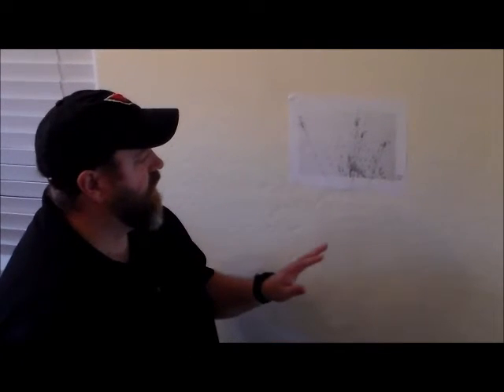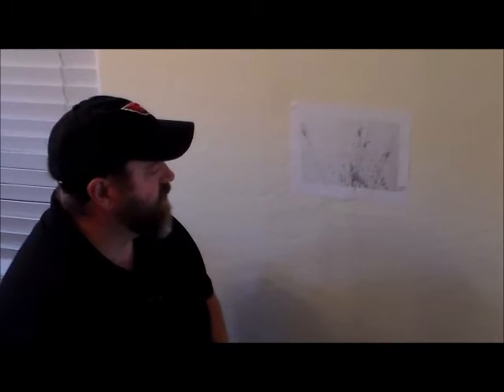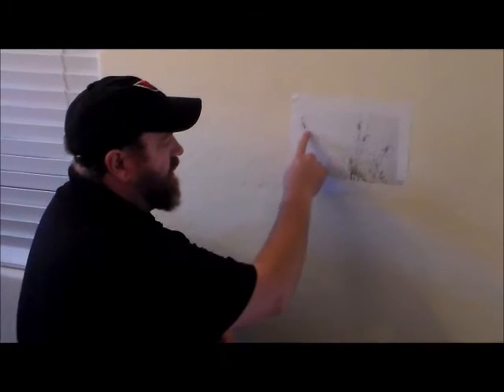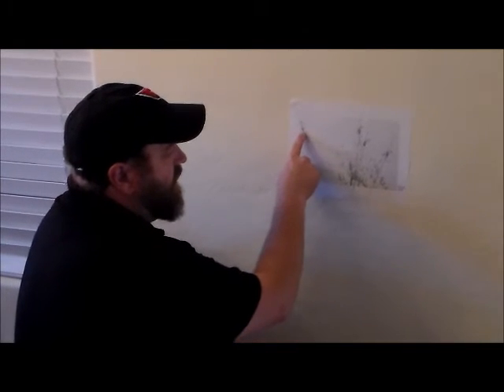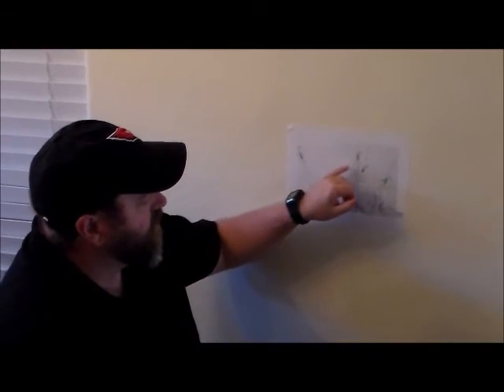We identified the droplets within our medium velocity impact spatter that we want to string to determine the area of origin. I measured each droplet's length and width, and using the formula from an earlier exercise, I determined the angle of impact for each one. I'll use those angles as I string these blood stains. I'm only going to demonstrate stringing two droplets, but you will string at least four droplets in your exercise.